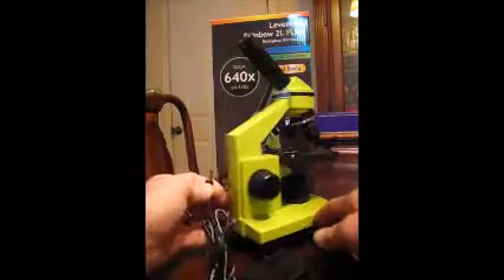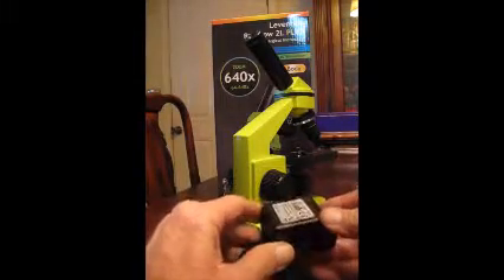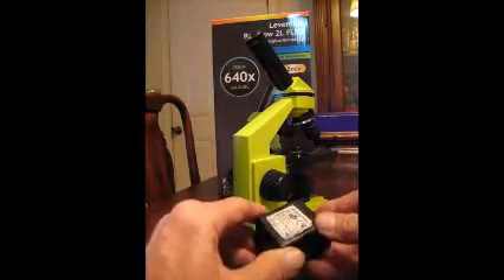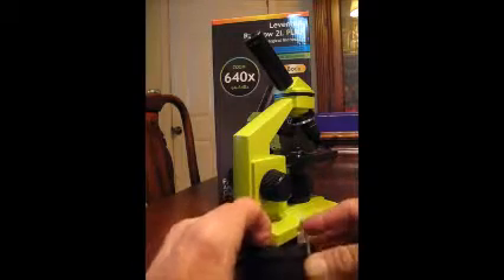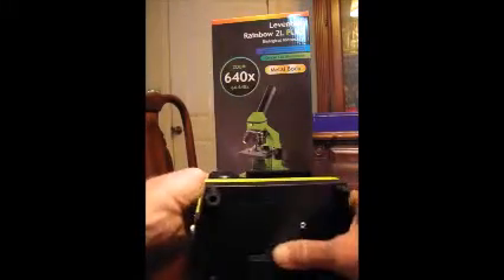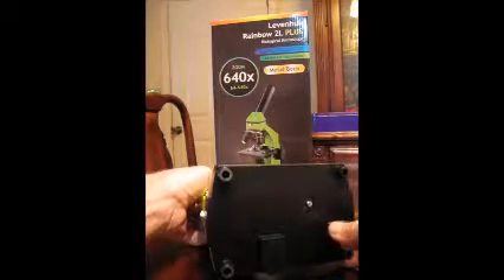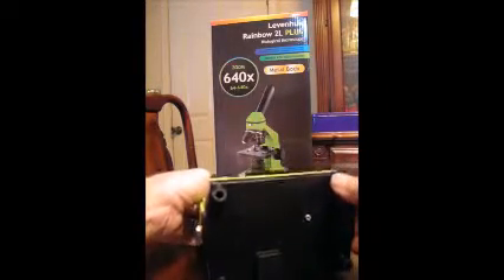On the back is a plug where you can power it with an AC adapter — just plug it into the wall and it powers the lights inside. There's also a battery compartment, so you can run it on batteries if you're out in the field or somewhere without AC power.